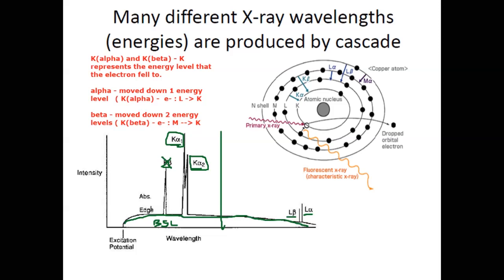If you do include it, it's going to throw off your intensities because instead of just being K alpha 1, K alpha 2, you're going to include the K beta. So it's going to make your diffraction spots more intense because now you have more X-rays striking the crystal. So for X-ray crystallography, we're only interested in the K alpha radiation. And we'll talk about what alpha 1 and alpha 2 are in just a moment. So those are the characteristic X-ray photons.